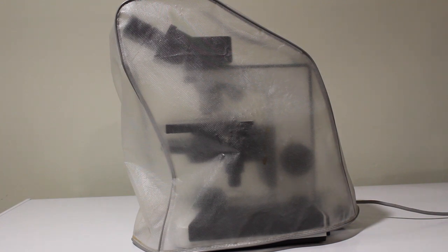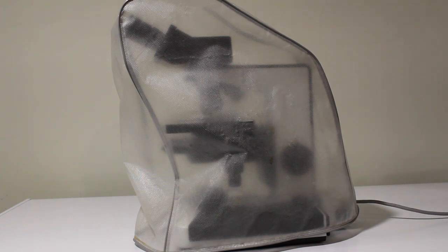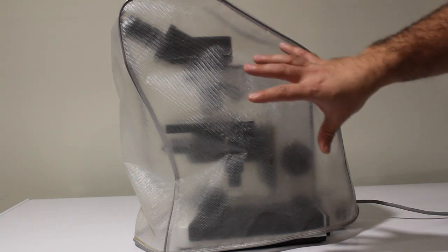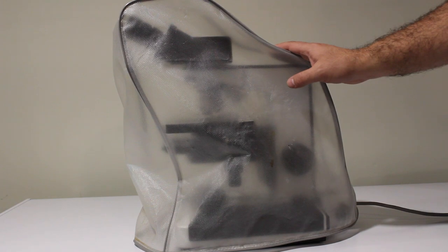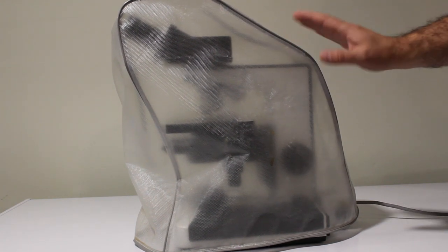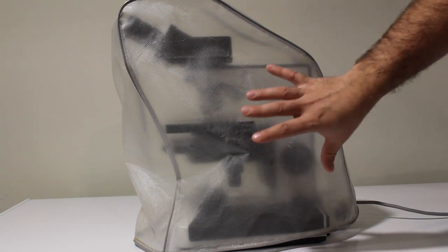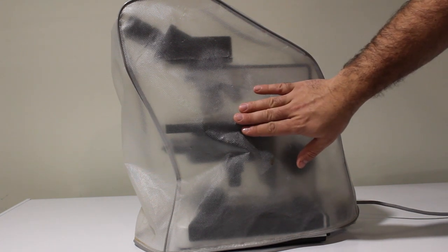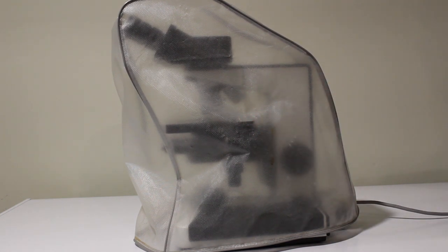Now, as cheesy as this may sound, this cover really is the secret to this microscope's long life. There's a lot of really fine parts in here, small gears, optical components that are very sensitive to dust and moisture. And so, of course, having a cover on your scope whenever it's not in use will help to protect all of those parts. Likewise, moisture is a major risk factor for a lot of the components in a microscope, so you always want to be storing it in as dry a location as you can, preferably some place free of any sort of risk of leaks or humidity.